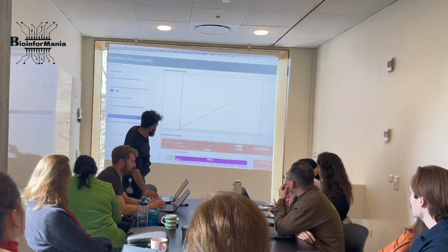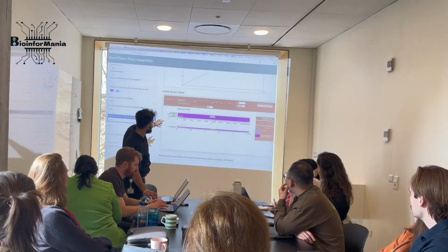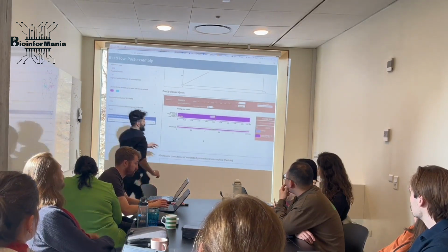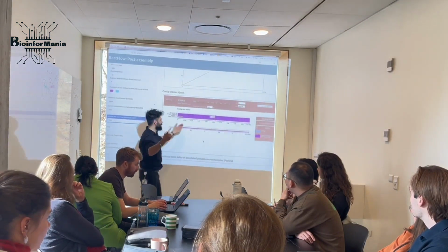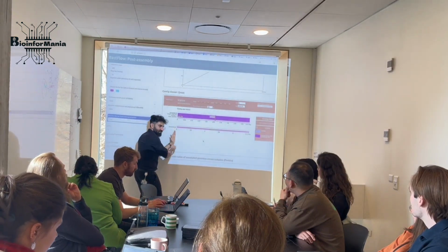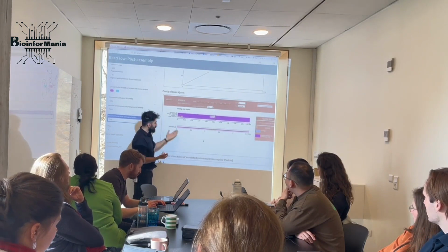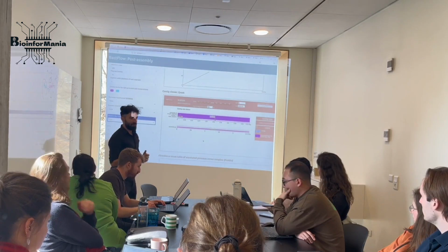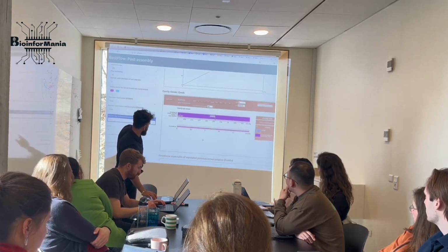Another one is the genome visualizer here. It shows you everything about the genome. So if I want to zoom out all the way out, you can see that N50 and N90 are both happening all across the genome. So we have only one contiguous contig. In some cases, if it's a comparative genomics case and you have a lot of genomes, you can look at them, you can see how their N50 looks, are they scattered, do they have plasmid or not, and so on and so forth.